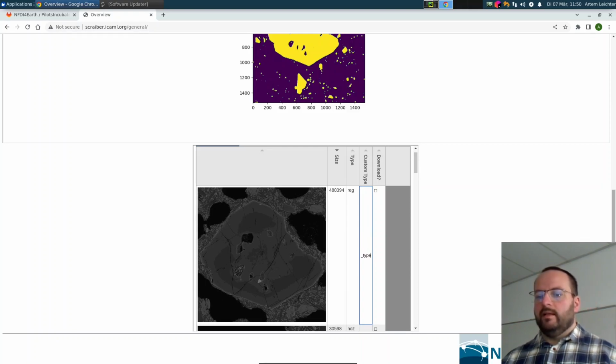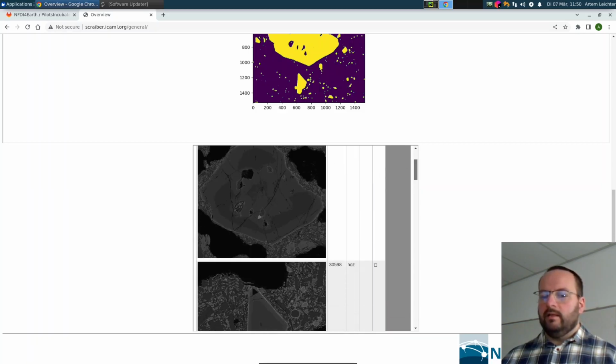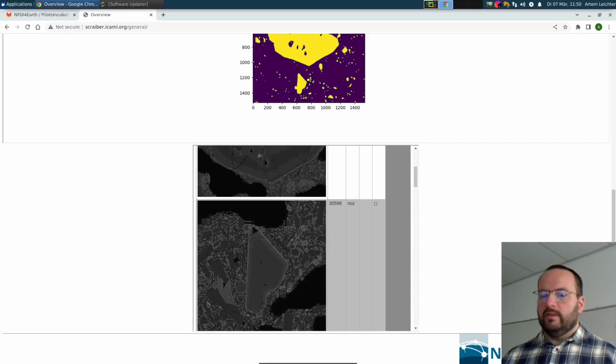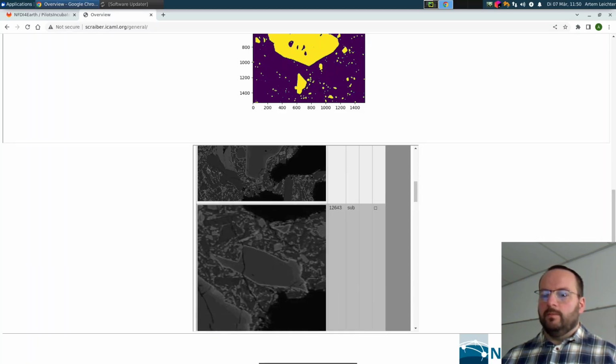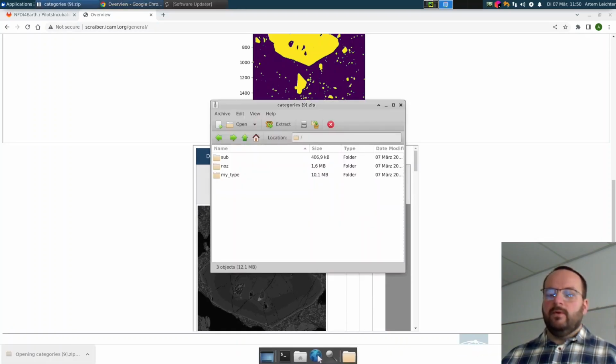We can say that we want to download the data for this crystal, and also we want to download this crystal, and maybe this subcrystal also. Okay, and when we have selected them, we can say download, and a zip file is downloaded.